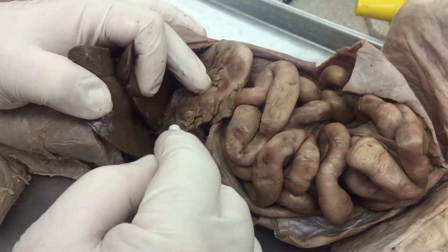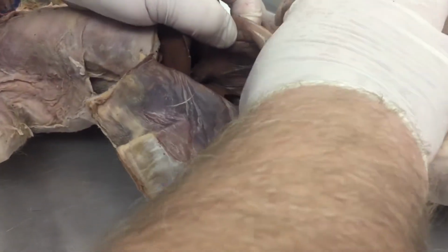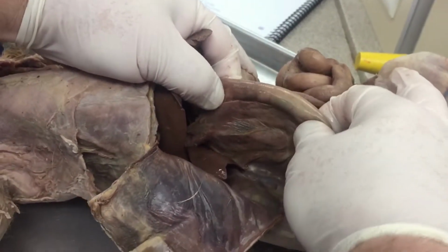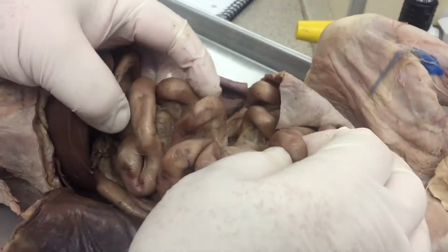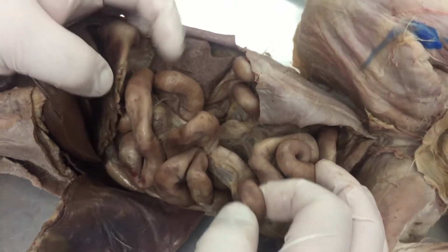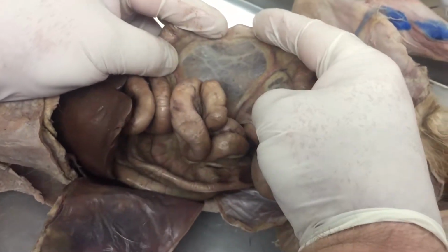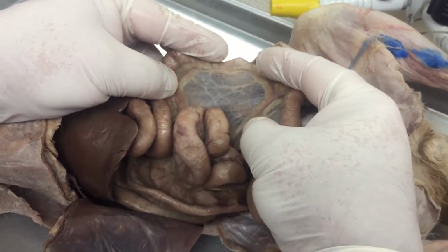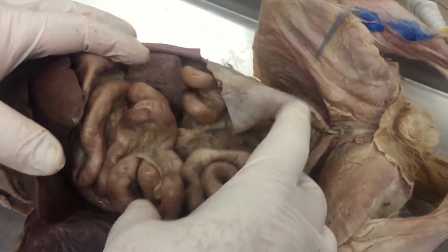So back to the small intestine, we have the duodenum. Then a small portion of the small intestine which is stuck to the back body wall and is pretty straight. That's the jejunum. And then there's a wiggly portion of the small intestine, which is called the ileum, which makes up most of it. The ileum also has a material that is part of the peritoneum, which holds everything together, and that is called mesentery, that has lots of blood vessels in it because the ileum is picking up the nutrients and putting it into the bloodstream.